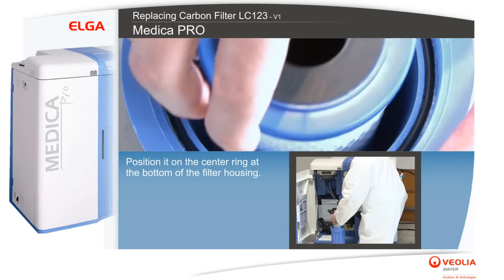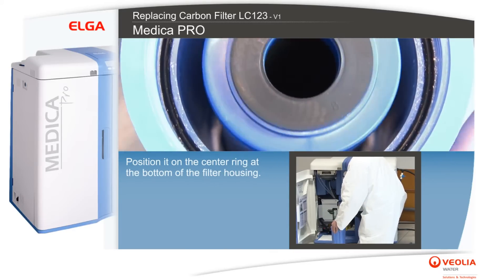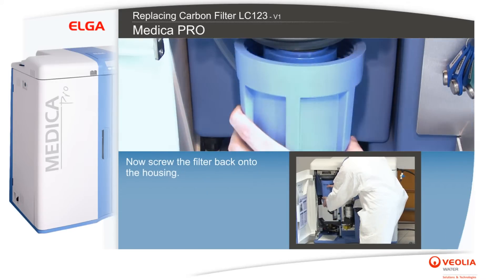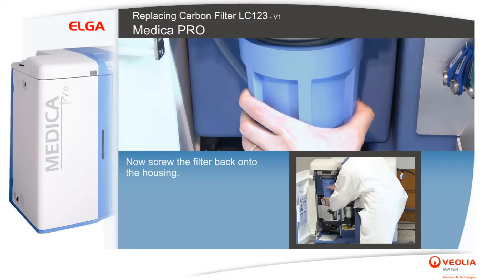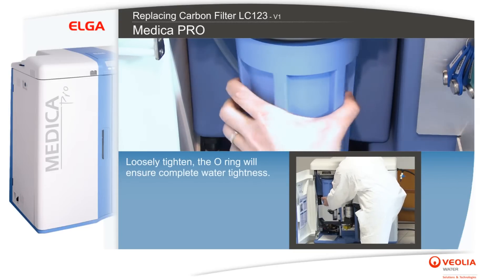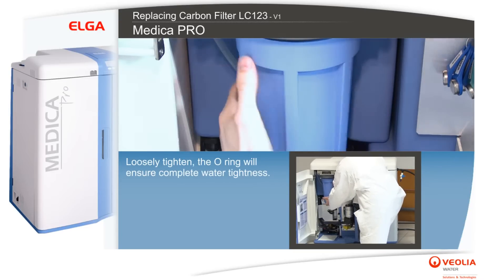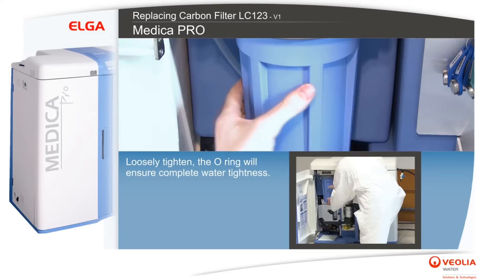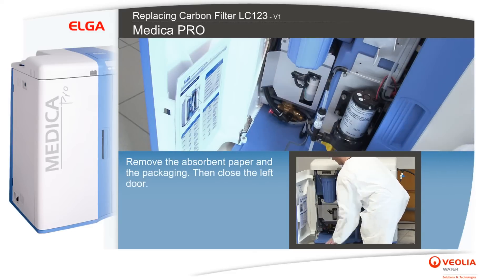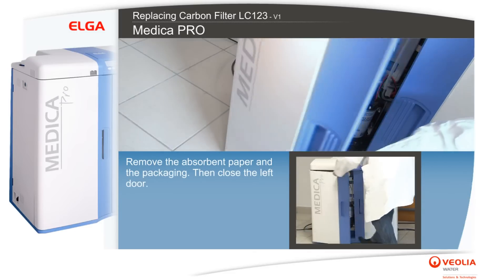Position the new filter on the center ring at the bottom of the filter housing, then screw the filter back onto the housing loosely. Tighten it — the o-ring will ensure complete water tightness. Remove the absorbent paper and the packaging, then close the left door.